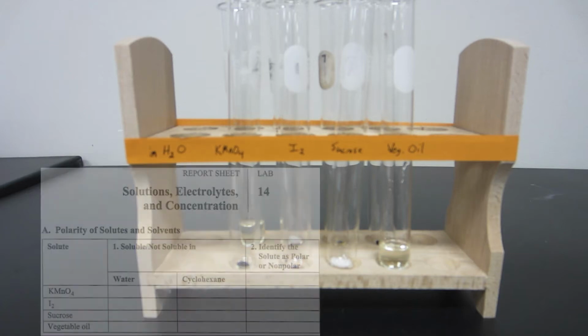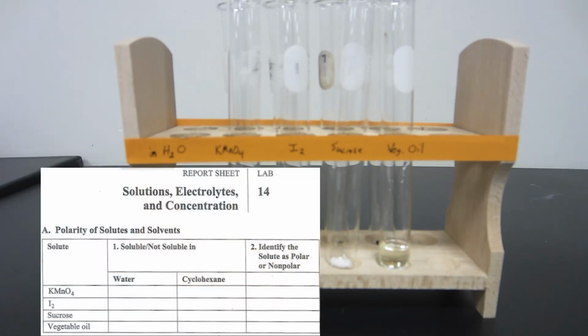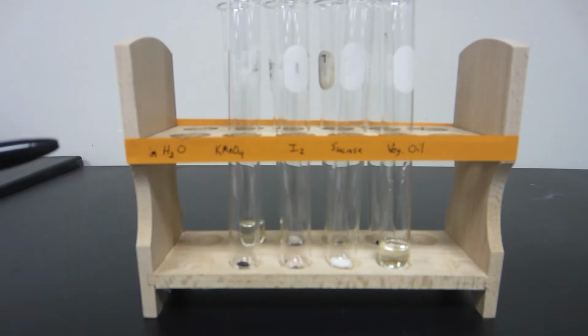So what you're looking at here are the four solutes that are listed on page, for lab number 14, part A. It's on page 163. It's that top table, and I have the four solutes listed here. I'm doing the experiment a little bit differently than is described in the lab manual, but it'll still illustrate the solubility trends here.